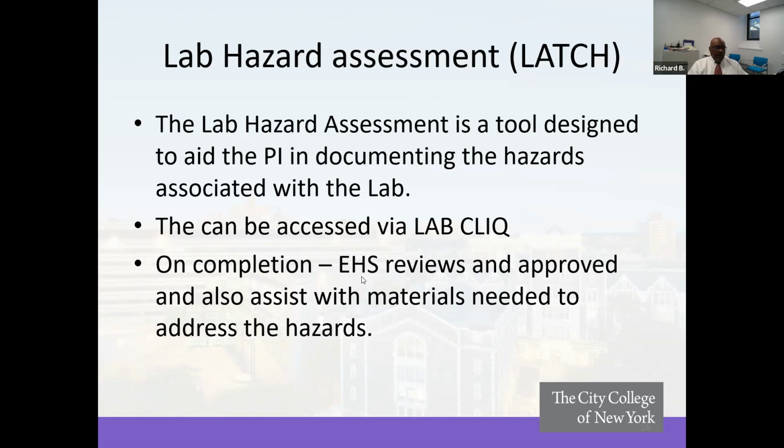When a lab hazardous assessment is completed, it comes immediately to the Environmental Health and Safety Office. We will review it and approve it. We probably will not approve a lab hazardous assessment if it's missing critical information. The critical information would include, have you done a comprehensive analysis of the hazards associated?